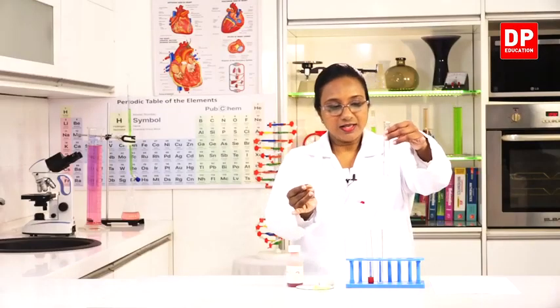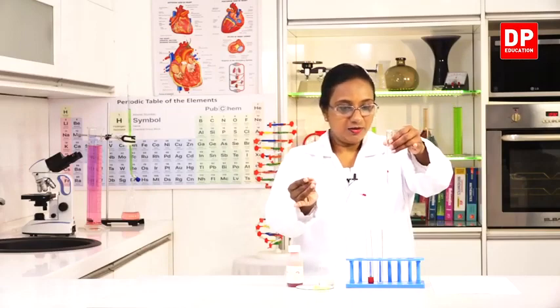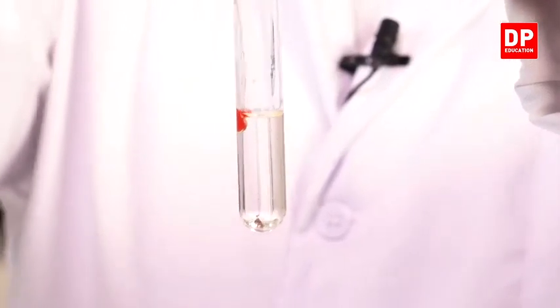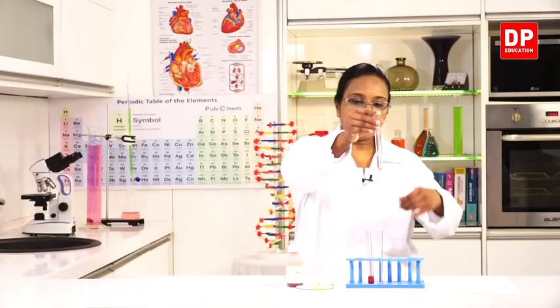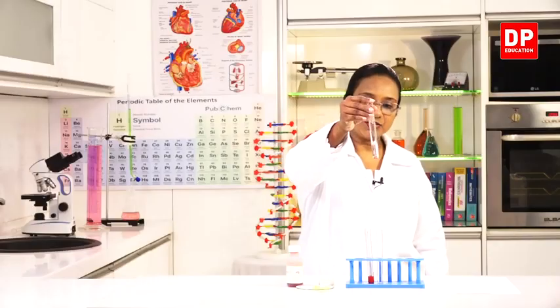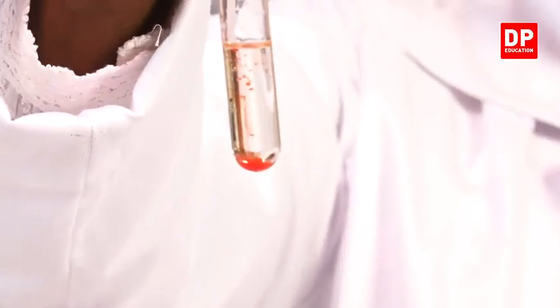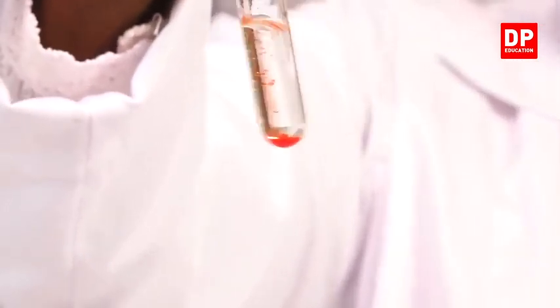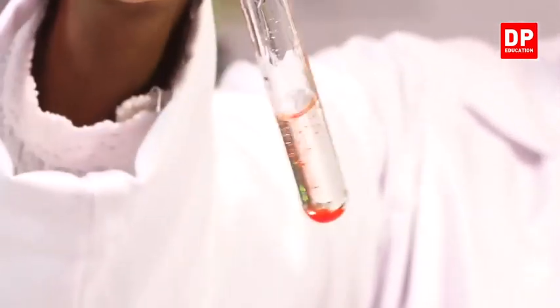Here you can see the Sudan 3 moving down along the oil, and when we mix it well, you can see the appearance of red fat globules. Here, students, you can observe clearly the appearance of red fat globules.